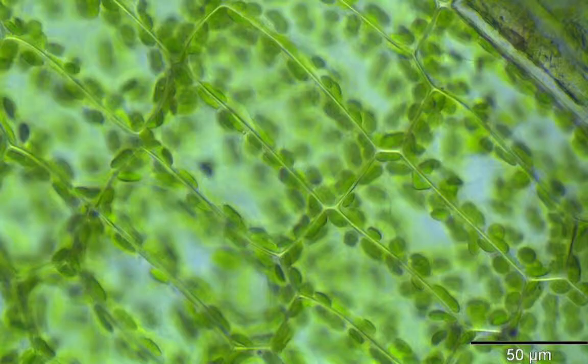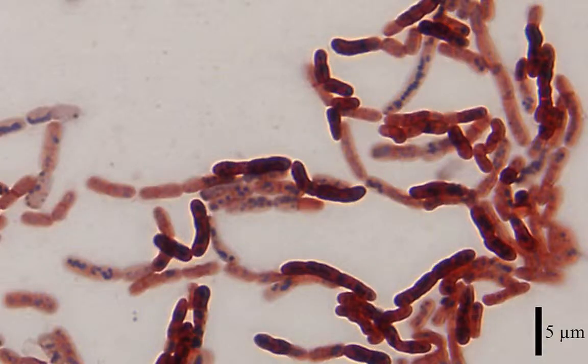Microscopes are useful because they allow us to see small things. And no, I don't mean small like the bottom of the line in the eye chart. I mean really small, like things we can't see with our eyes alone. For example, these plant cells are about 30 microns wide, or about 1/3 the width of a human hair. But microscopes can easily see much smaller things than that. These bacteria cells are about 1 micron wide, or 1/100th the width of a human hair.